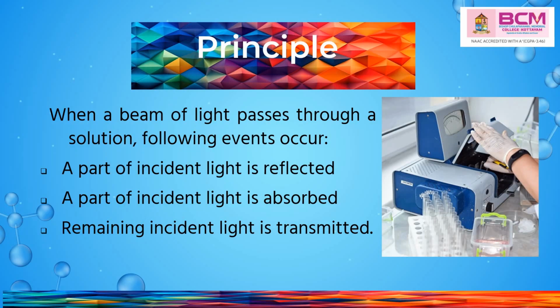When a beam of light passes through a solution, the following events occur. A part of incident light is reflected, a part of incident light is absorbed. The remaining incident light is transmitted.